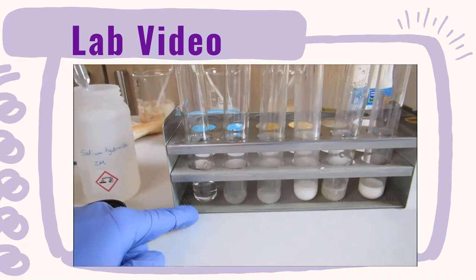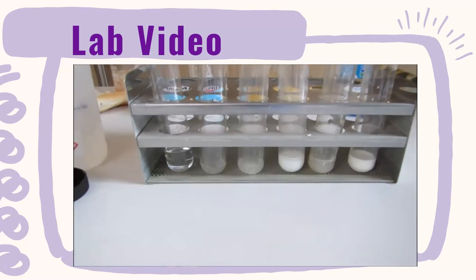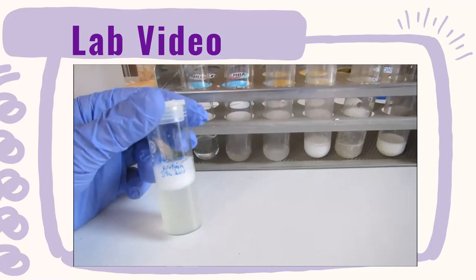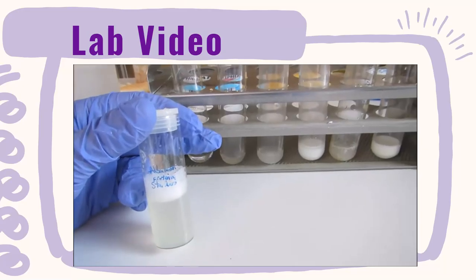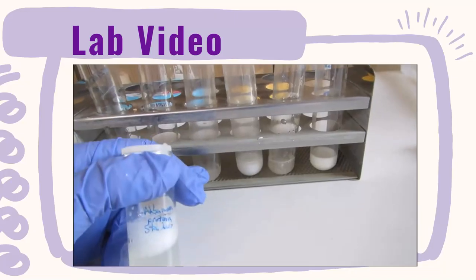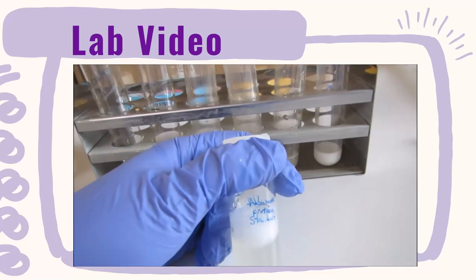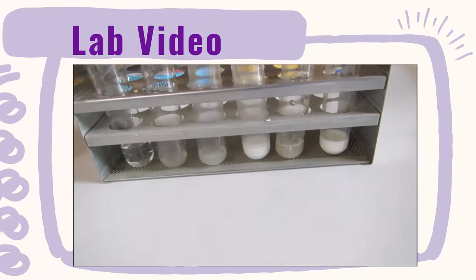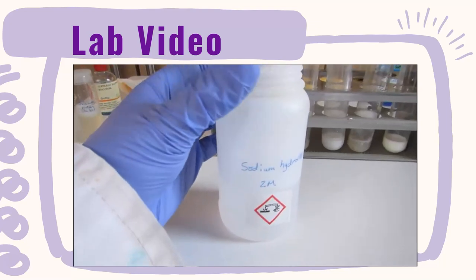So into my test tubes I've already measured. So first one is deionized water. This will form our negative control. It should not react because it shouldn't contain any of the food groups. The second is a positive control. So the first one I'm going to show you is a protein test. So I've got an albumin standard. This is a protein standard, and so it should show us what a positive reaction looks like. Next, I put my 4 foods. So tube number 3 is bread, tube number 4 is the cheese spread, number 5 is the banana, and finally number 6 is the milk.